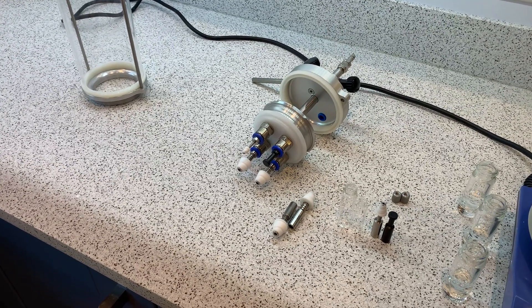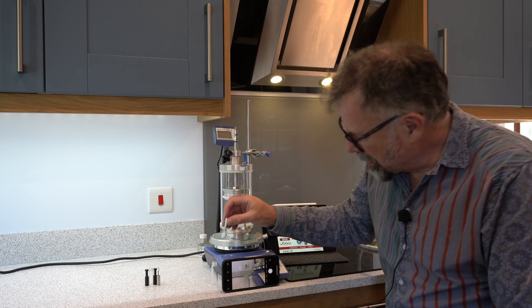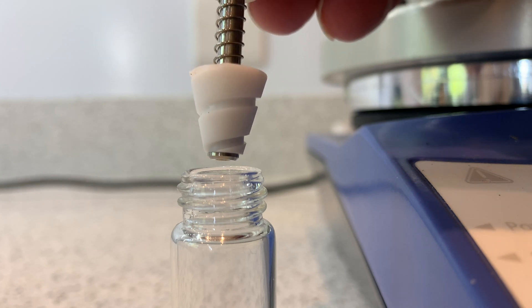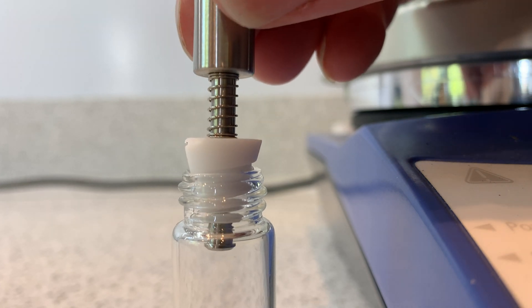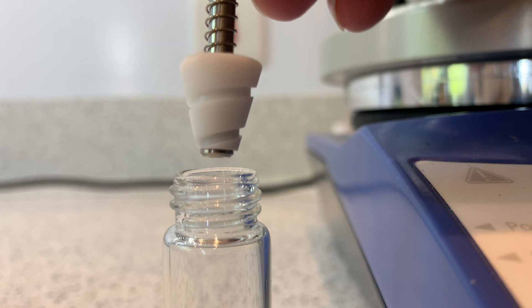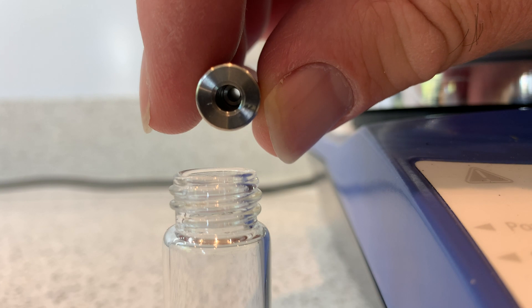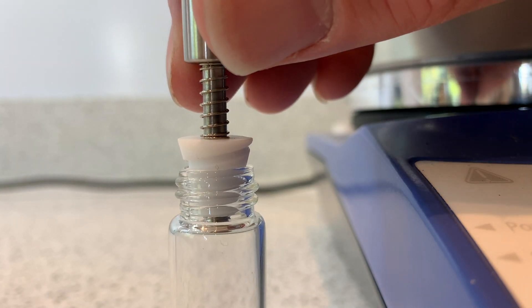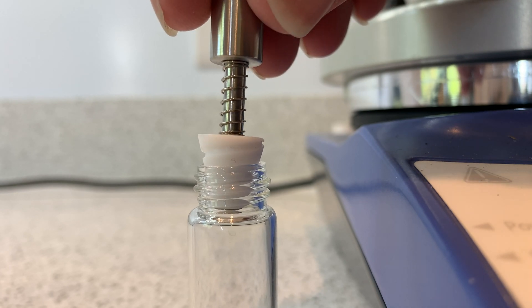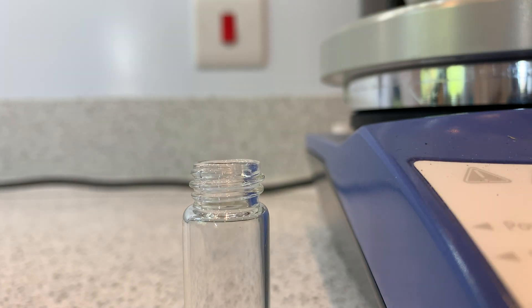As promised at the start of the video, here's how the spiral plugs work. The spiral plug has a groove cut into the outside and a spring, and it fits quite a wide selection of tubes. There are different sizes of spiral plug depending on tube diameter — normally a set of four will cover the range of tubes you may have. Through the centre, we pull a vacuum; the vacuum pulls in air or gas — whatever your atmosphere is — through that spiral, and that gas spins around quickly, pulling a vortex of liquid up against the sides of the tube.